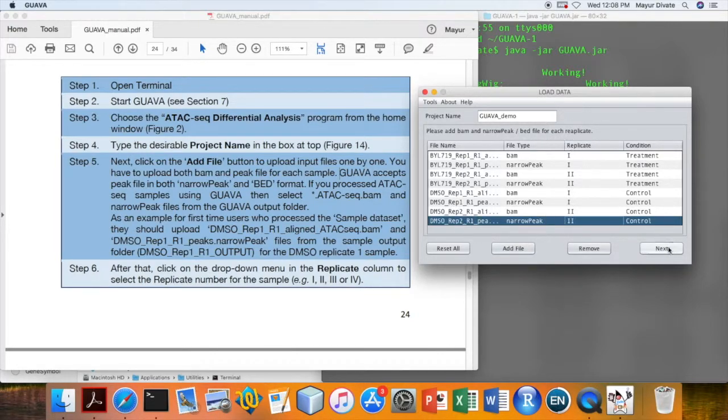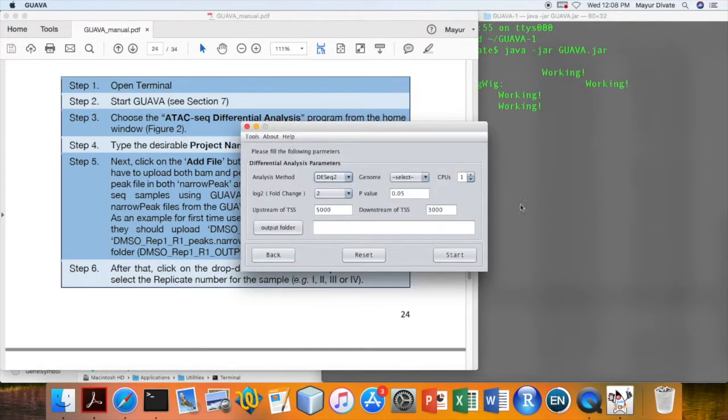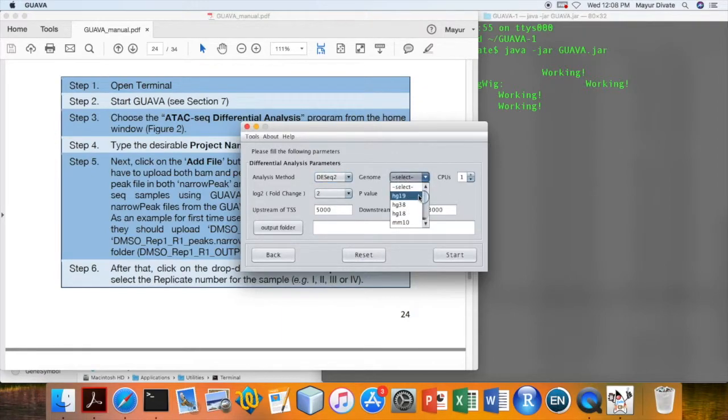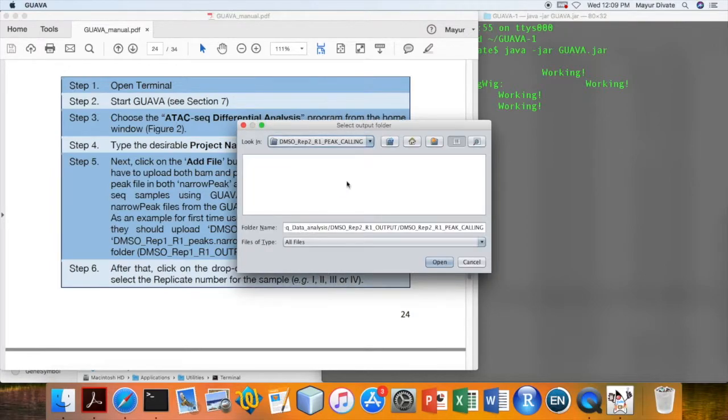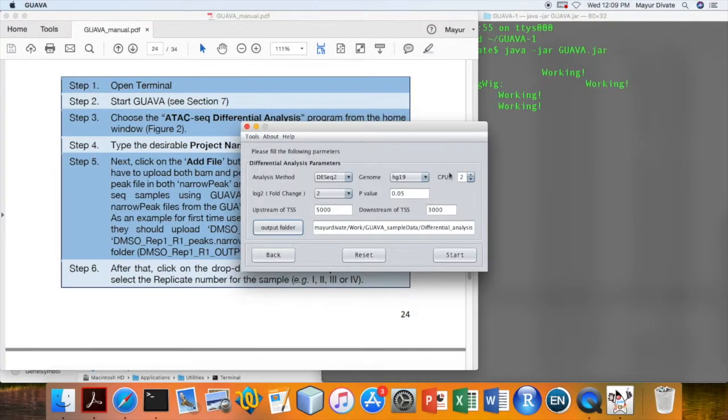Then click on next. Here change the genome assembly to HG19. Keep everything else default and select the output folder to store the analysis results. Finally click on the start button to start analysis.